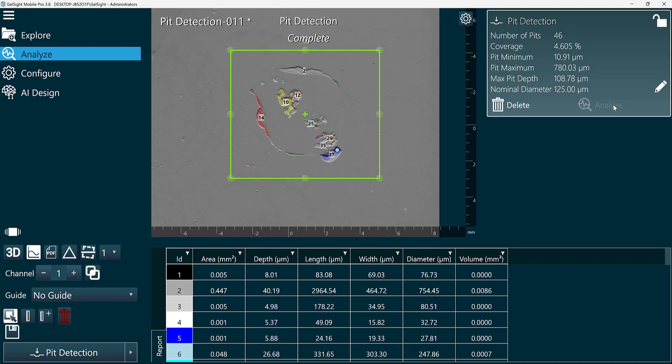The output of pit detection includes the characteristics of every found pit in addition to the number of pits and the coverage percentage.